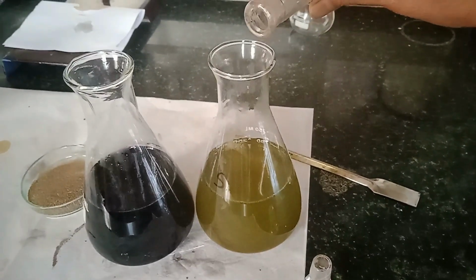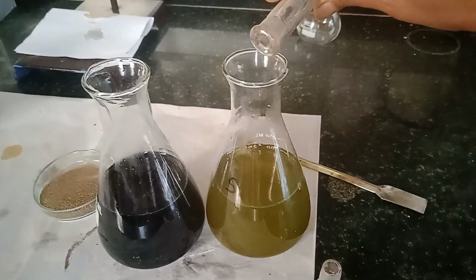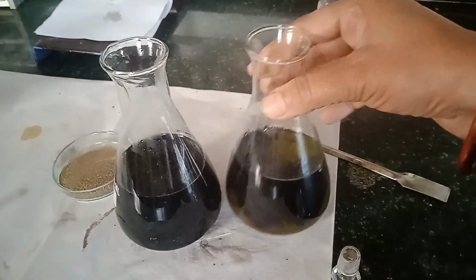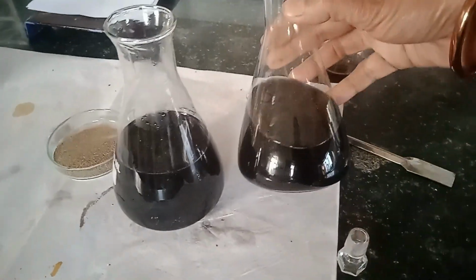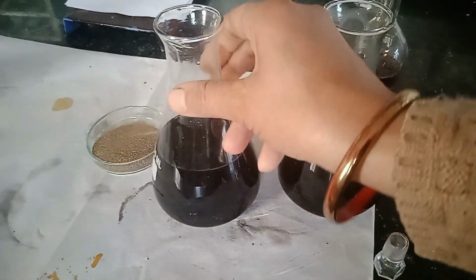And similarly I am going to add 2-3 drops of diphenylamine to the sample. So, change in color. Now we are going to titrate both sample as well as blank one by one.